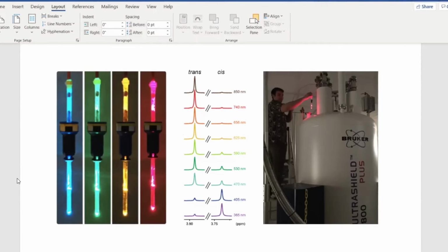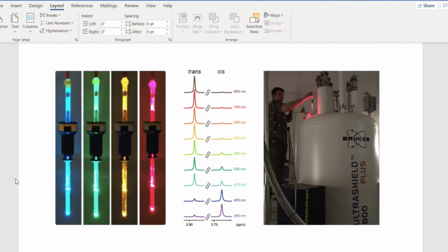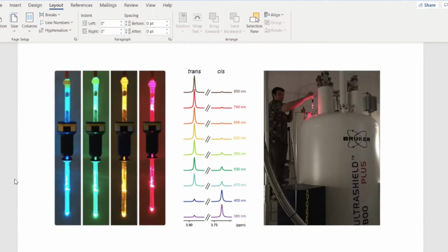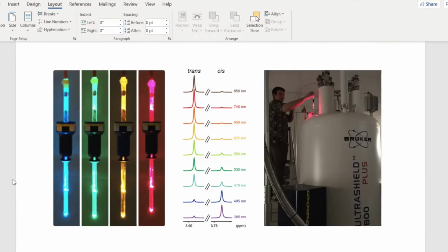Great. How would you describe the assistance that you've had with the NMR staff when it came to troubleshooting or designing experiments? The staff is phenomenal. Jeff and Ping really do treat these instruments like they're their baby. They really help me tailor the experiments to accommodate this photoswitchable probe that I installed.